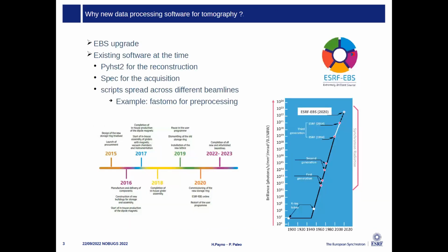Okay, so let's start with why we have new software at the European Synchrotron. We went through this extremely brilliant source upgrade that I guess you heard about, and this brings new opportunities for imaging and tomography that we want to benefit from.